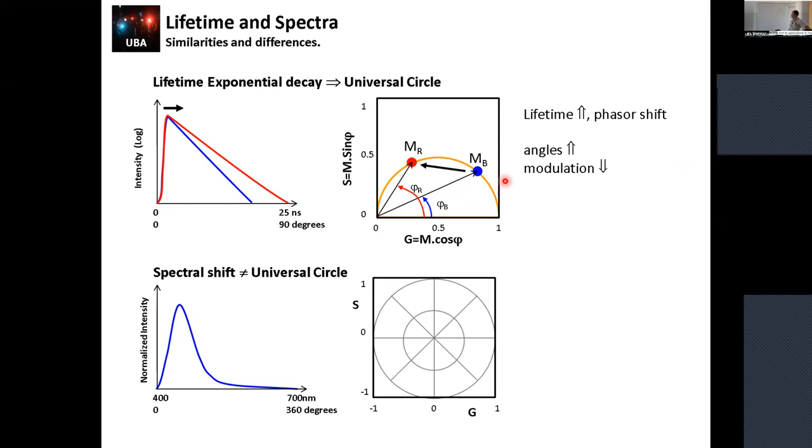And the thing is, what can we compare between hyperspectral imaging and lifetime? Well, first of all, as Enrico mentioned, and also Richard and Dave commented today, to do the phasor transformation we need a period. This is an important thing. We always need to have a period, and this period needs to be fixed. We cannot change it, because otherwise our reference transformation will change, right? So in hyperspectral imaging, we have a period because our detector has a period by default. It starts at a point and finishes at a certain other point.